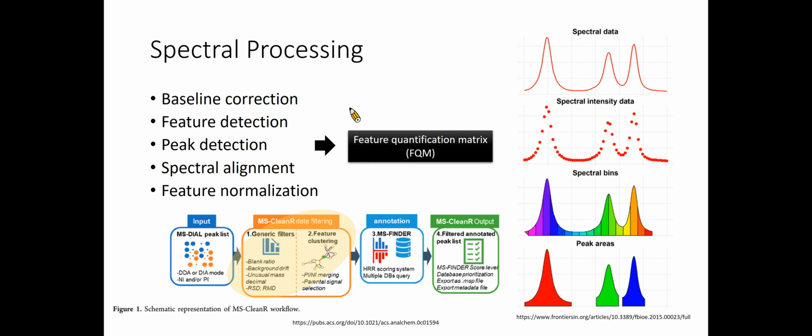Spectral processing is a methodological approach aimed at accurately identifying and quantifying the features in the sample spectra of a metabolomic study. Metabolomic spectra are sequentially or jointly processed until a final set of feature quantifications is obtained. Spectral processing is also necessary to guarantee that each final measurement will refer to the same metabolomic feature in all samples.